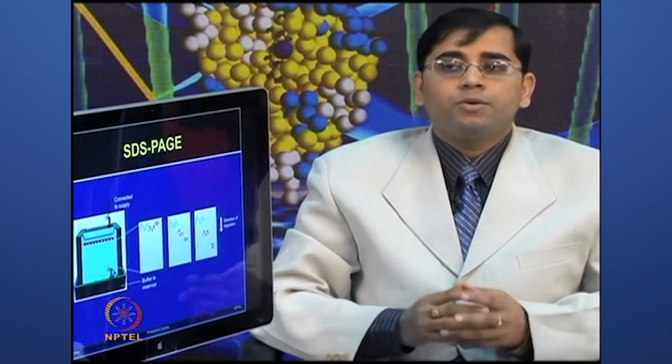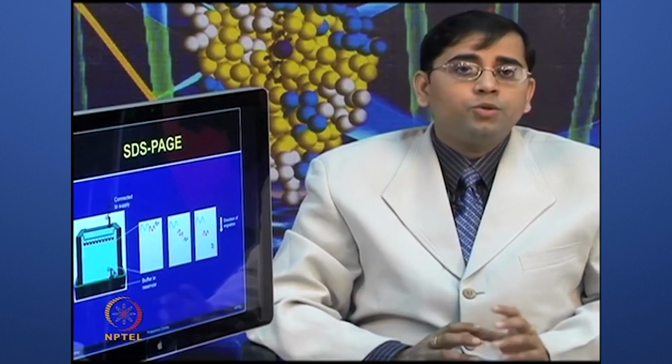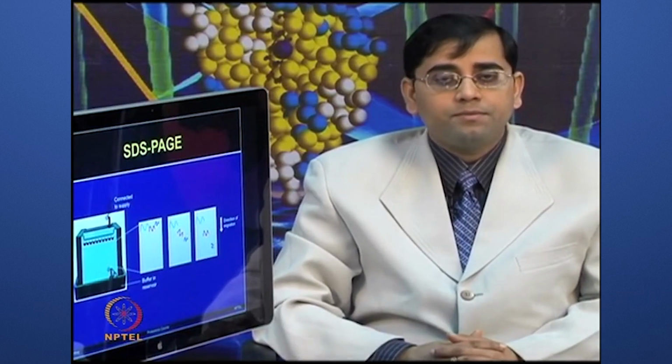Since we are talking here about the 2-dimensional gel electrophoresis workflow, I think it is important to clarify that in 2DE, when you use SDS page, you do not need to make these wells by adding a comb, because you already have a flat IPG strip which has done the first dimension protein separation.